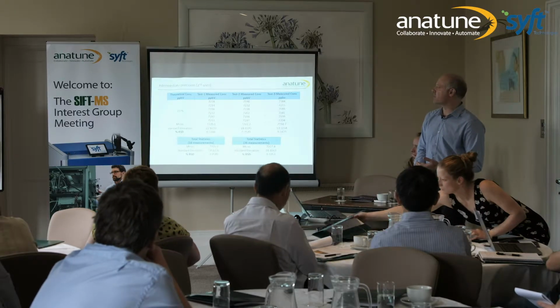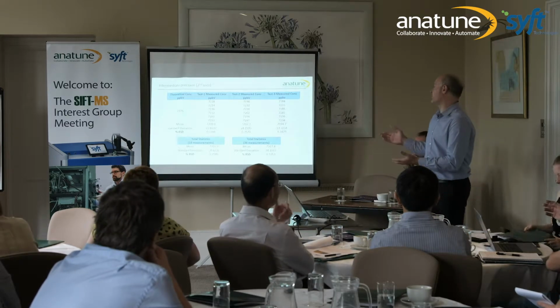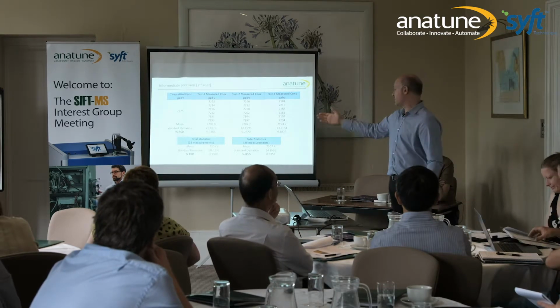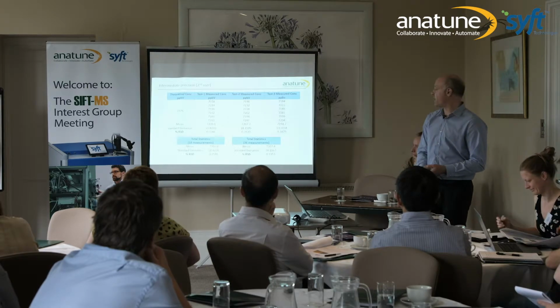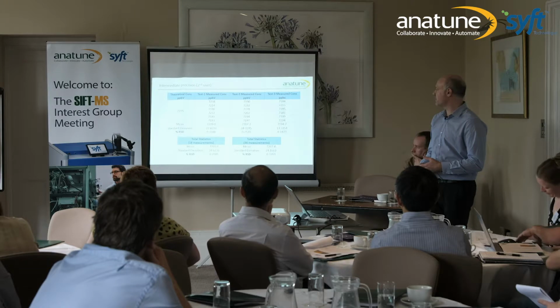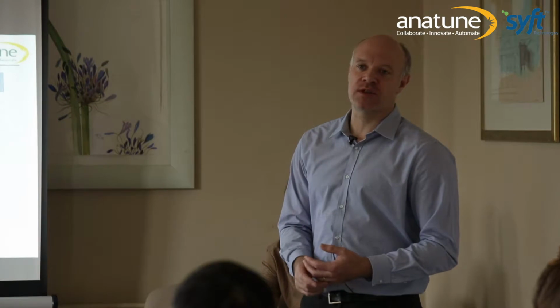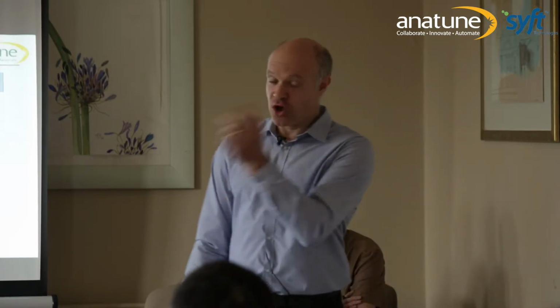And again, prep the samples at the same 7.2 ppmV, run the samples again, and pretty much replicated what we saw the day before. Again, RSDs of less than 0.4%, recoveries of around 99% plus. So precise. And when we stick these two measurements together to give 36 measurements of formaldehyde in a Tedlar bag, incredible precision for this, and as I said yesterday, no internal standards. So it works really well.